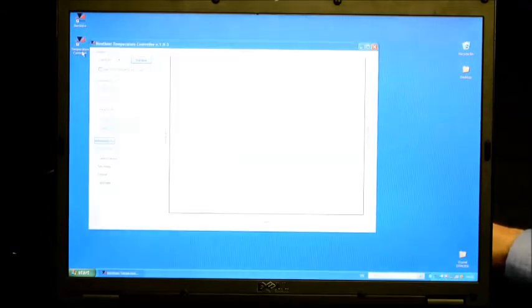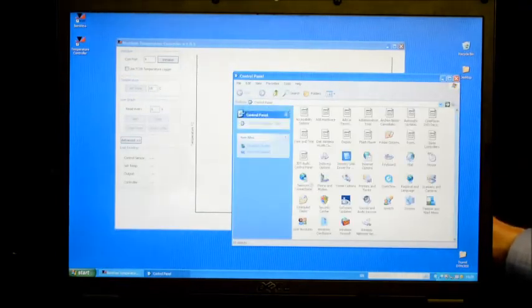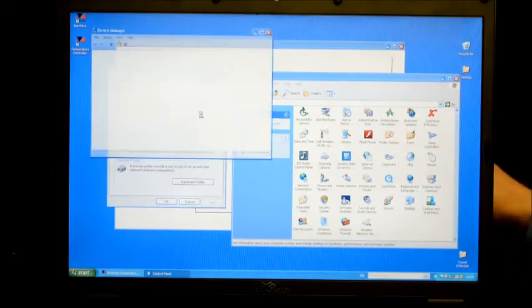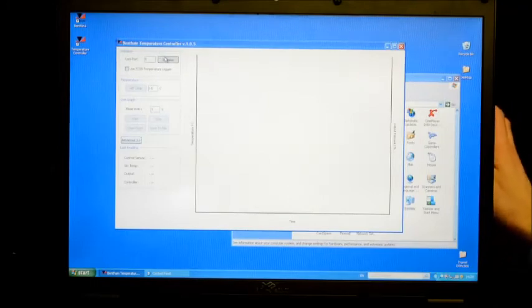Running the temperature controller software, one is shown an interface. One should determine the COM port in which this device is in use. Going to Control Panel, System, Hardware Device Manager, or the equivalent on your system, one should see a ports element, and here the USB serial port has come on COM5. One must therefore input 5 and initialize.